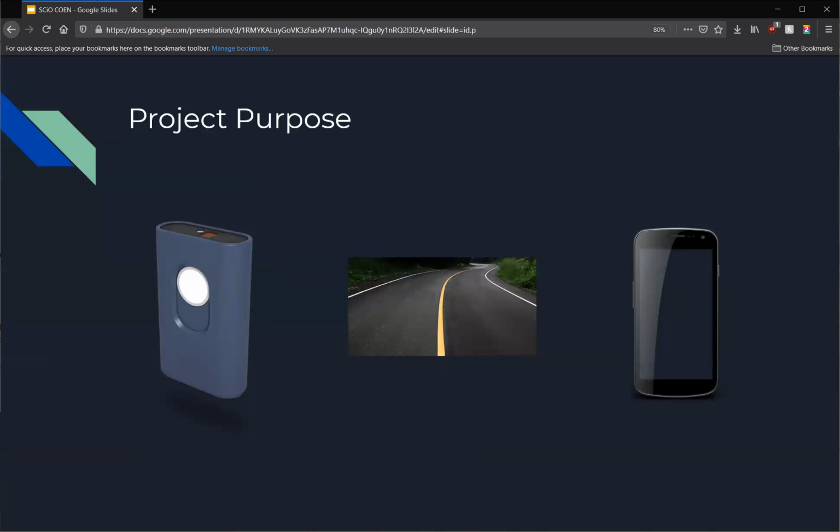Our team was tasked with using an NIR spectrometer called the SCiO device to create machine learning models that could tell the difference between different percentages of anti-strip in asphalt samples, and to develop a mobile app to interface with the device.